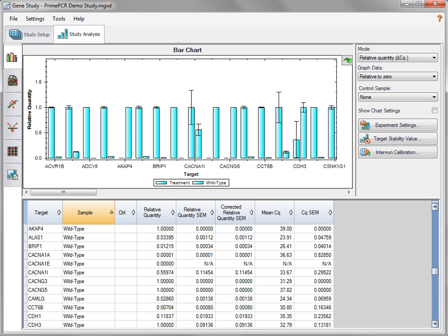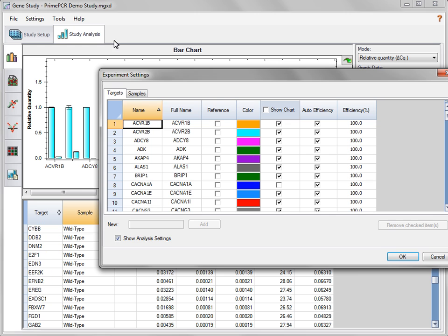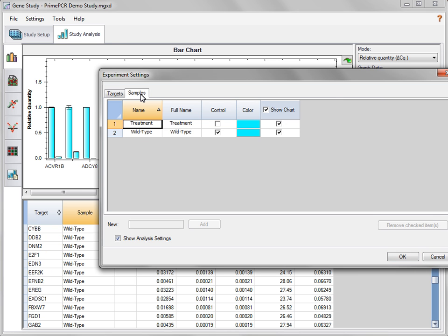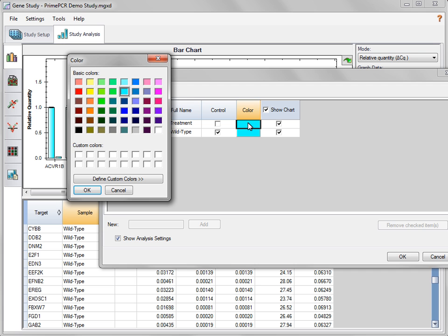The bar chart displays relative expression in a chart and spreadsheet view. Change the color of bars in the chart by opening the Experimental Settings window and then clicking in the Color column. Choose another color for a target from a window that appears.